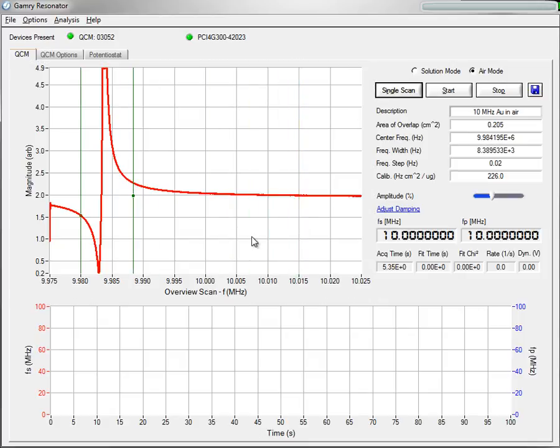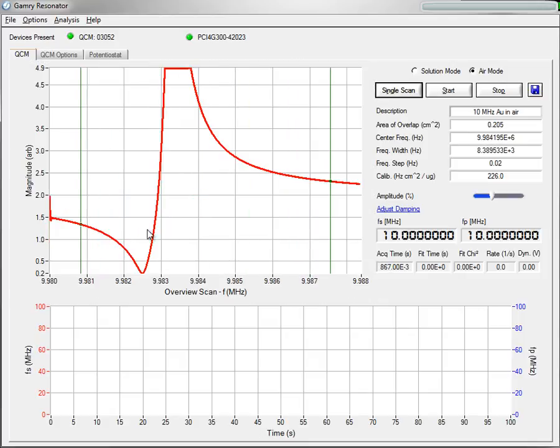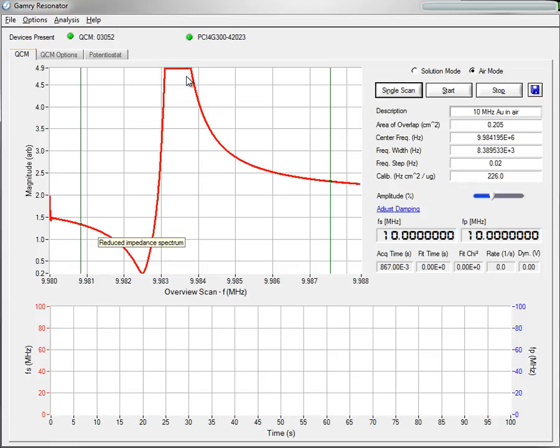I'm going to bring it a little further and hit Single Scan again. And now we can see, again, it looks pretty normal except we're maxing out on our voltage here on our magnitude.